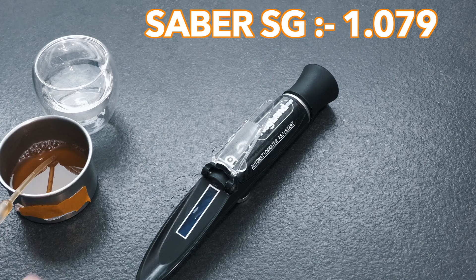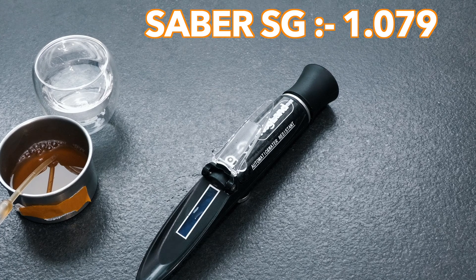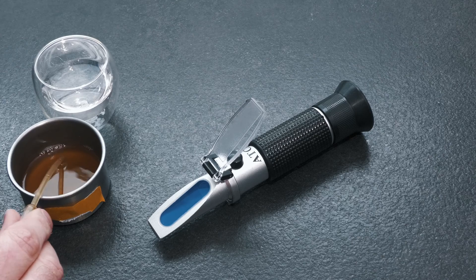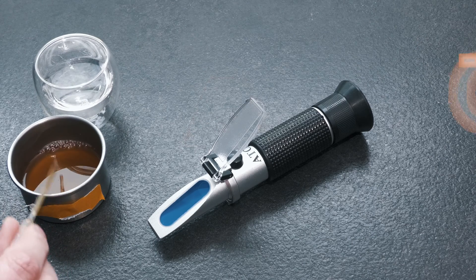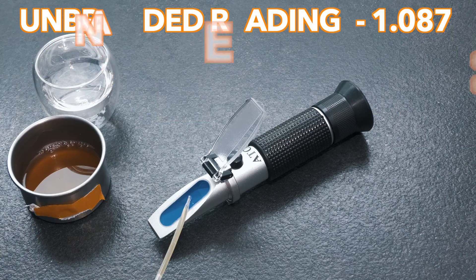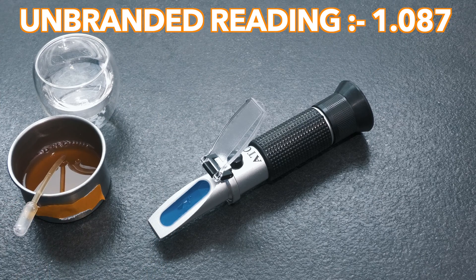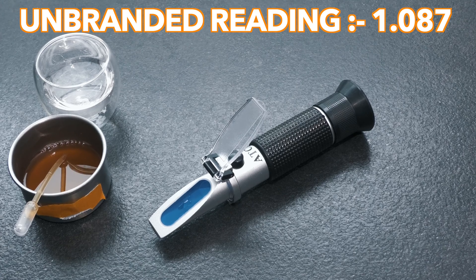So this result shows that the Sabre is three gravity points inaccurate in this test, which is actually better than I expected at this level of gravity with a device of this type. It was then the turn of our budget, unbranded, blue box refractometer, which was also loaded with the same sample, and returned a specific gravity value of 1.087. So with this refractometer we see a result that is 11 gravity points above the accurate level, which does not surprise me considering the level of gravity with any device of this nature.